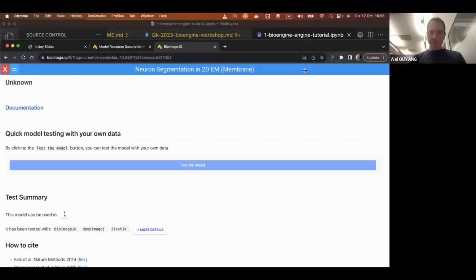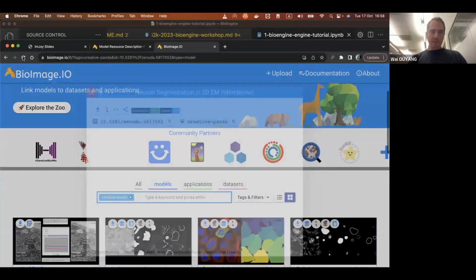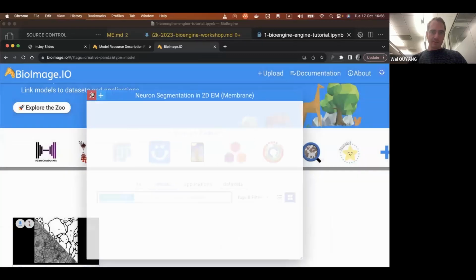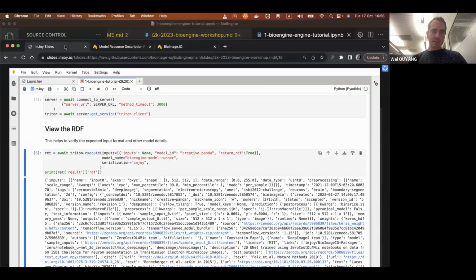So let me just show you that again. You might have heard me talking about what I was doing, but you probably didn't see what I was doing. So let's go back. So close this down, get rid of that. Right. Okay. So what I was trying to show you there is just that from the ID that we gave as an input here to the execution.